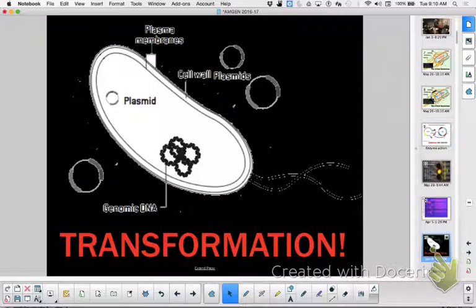That's huge. Now, who cares about making things red fluorescent, though you can make these RFP glow fish that are kind of cool, right? But what would be really something you would want to make? Making insulin, right, for people? This is a way that you can just visibly see, because you will have bacteria that you're not going to give your plasmid to compared to ones you did give your plasmid to, and you'll see the difference phenotypically in the proteins that express. You can visually see that, where it's kind of hard to look at a bacterium and go, I hope you're making insulin. You can't really see that. So that's why we're doing this with colors.